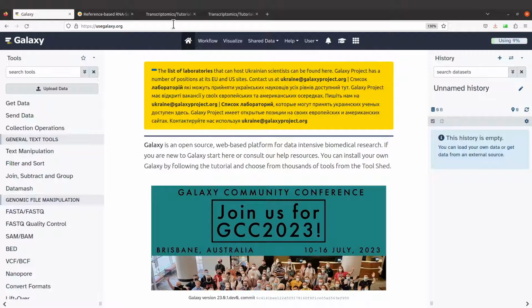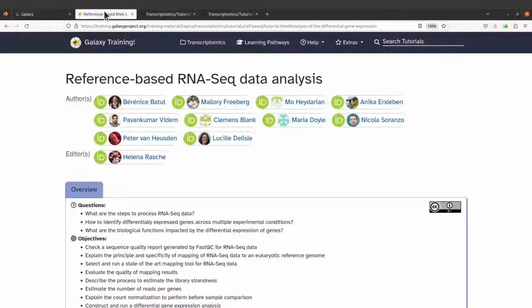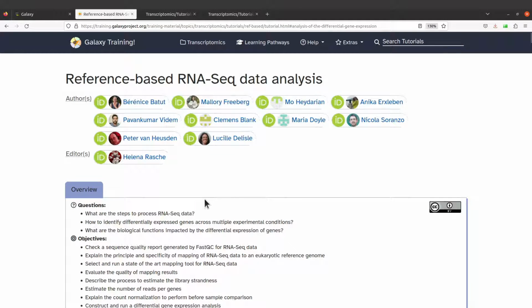All right. So for the example data, I have it here. Don't worry, we'll look at it later. All right. So this is what we are going to do. We are going to reproduce this tutorial here. Just check the description box, you'll find a link to this page.